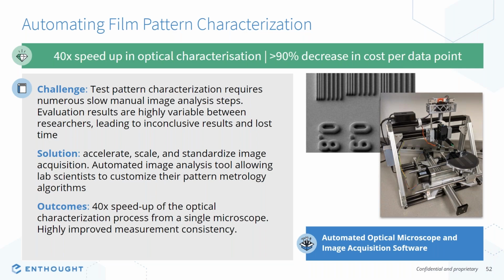So our solution to this problem was to develop a low-cost automated optical microscope that would allow them to put their wafer in, automatically have that system scan across the wafer and take images of the regions of interest, and present to the user an interface that allowed them to develop their own custom pattern metrology algorithms so that they could find things. For example, in this image I'm showing here, showing these lines, they could decide, what about these line patterns do I care about as an expert? I'm maybe going to characterize the spacing, the line width, roughness, other features. The scientists know what's really important, and we want to give them control over what's being extracted and teach them basic image analysis algorithms so that they can take ownership over that part of the analysis.